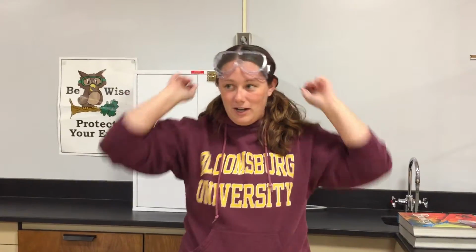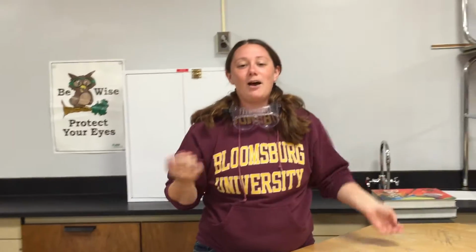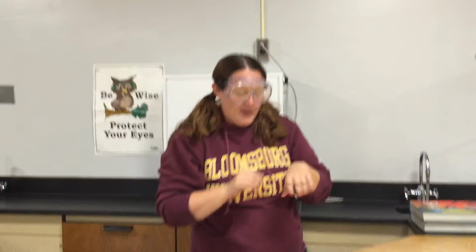This does me no good. I don't really know what I'm protecting. I look fabulous, but it's not helpful. Down here does not help either. My neck is super protected, but it's not necessary. Make sure they are up over your eyes. You will be yelled at if they do not securely fit over your eyes. Okay, we're ready to go.